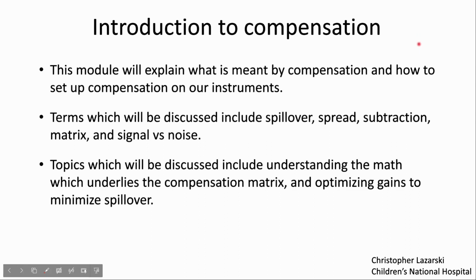In this module, we're going to do an introduction to compensation. My name is Christopher Lazarski, and I am the director of the Flow Core at Children's National Hospital. This module will explain what is meant by compensation and how to set up compensation on our instruments.